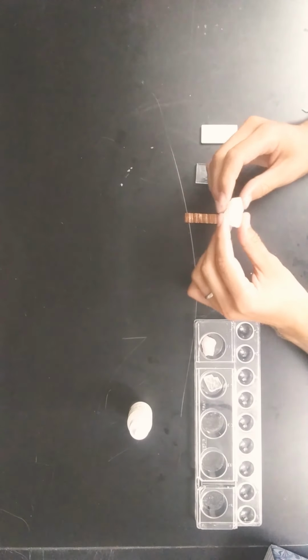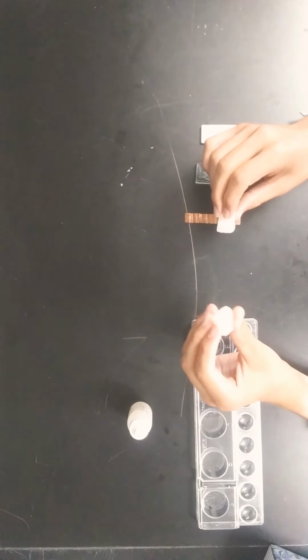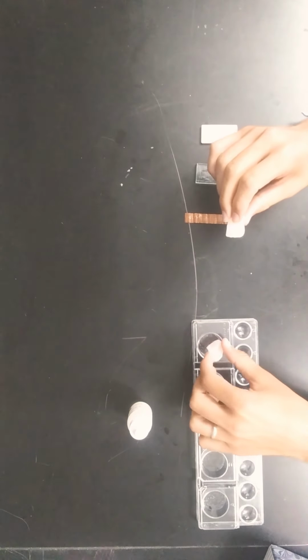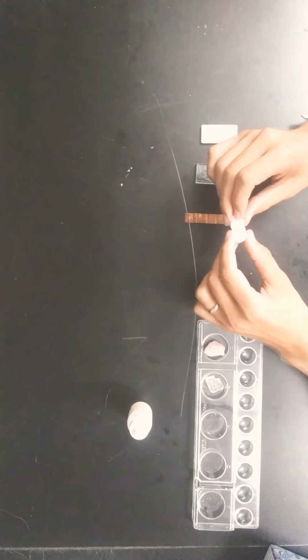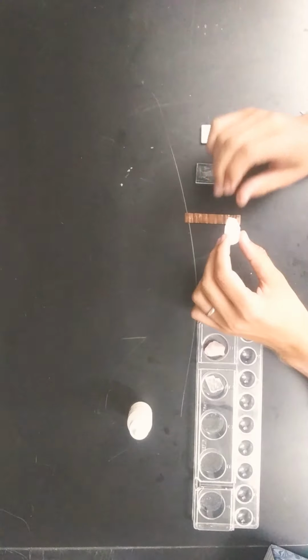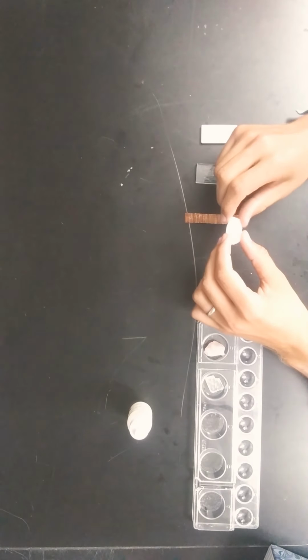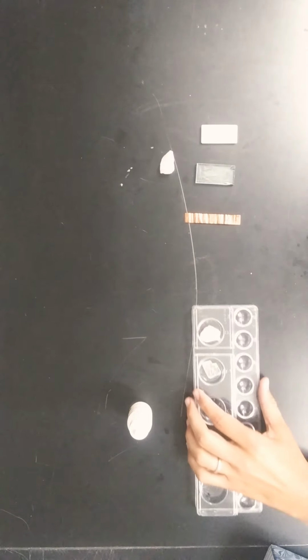This one piece that we're taking a look at is not transparent enough. It's pretty opaque, so we can't really check the refraction. If we had a clearer sample, we could check the refraction, and some of these might have a double refraction where we see two images on the inside. But we can compare this to calcite and how it reacts to acid.